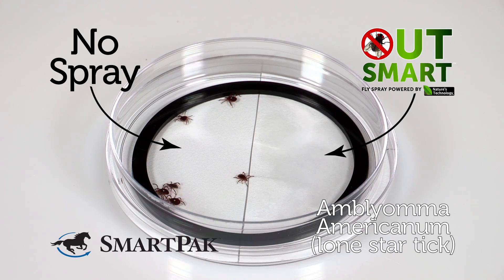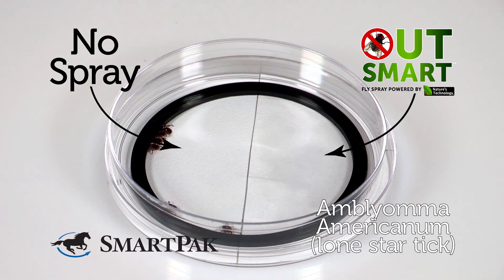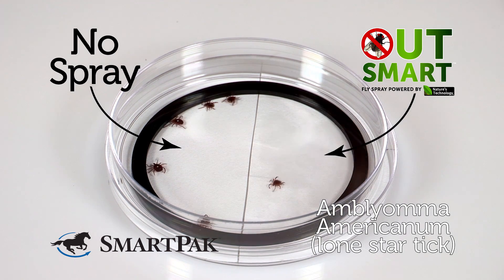The first species we used was the lone star tick, which tends to be very active and moves around a lot. What I'm seeing in this video is Amblyoma Americanum, the lone star tick. Initially, there is one specimen that runs through the barrier onto the treated side, but then is quickly dissuaded and turns around to head toward the untreated side.